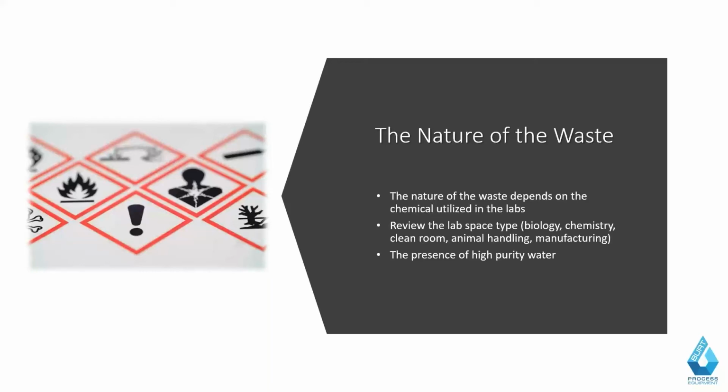That's pretty standard waste that you typically see going into a pH system. That's going to have some trace levels of chemistry in it. That's going to be washed down from cleaning detergents, CIP cleaners, things like that. And when you start talking about waste stream, it's going to go out of those ranges of pH 1, pH 13 and above. That's considered relatively strong waste. And all of that kind of needs to be taken into account. But in kind of a real world setting, how do you really determine what that pH is? It's a little bit tricky, honestly.